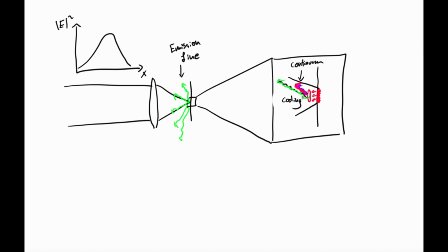Plasma light is collected using a second lens or in some cases an optical fiber. The collected light is transported to a frequency dispersive or selective device such as a spectrometer. Each firing of the laser produces a single LIBS measurement. However, by adding or averaging the laser plasma signals, the accuracy and precision are increased.